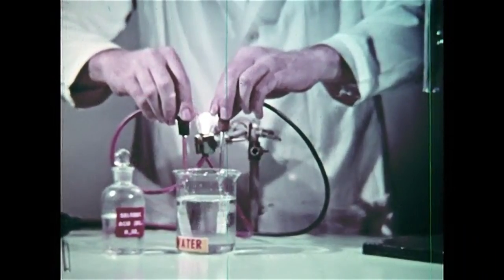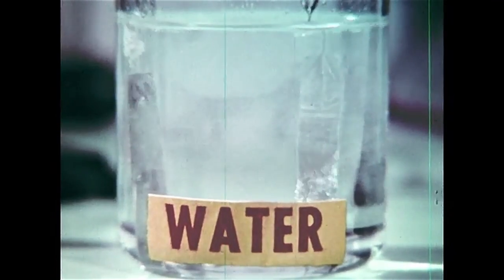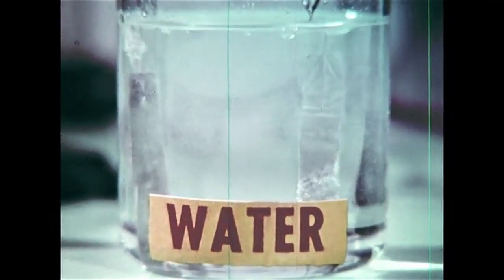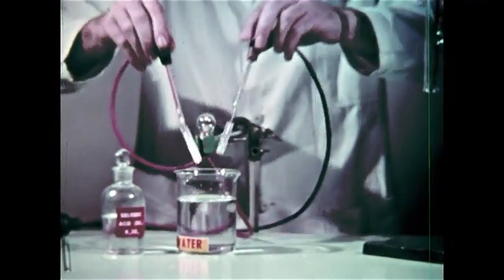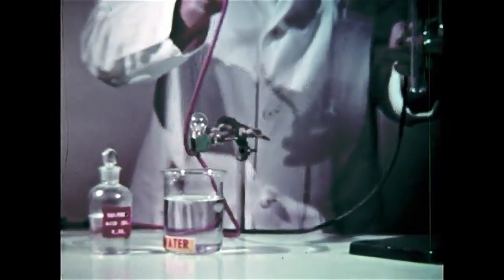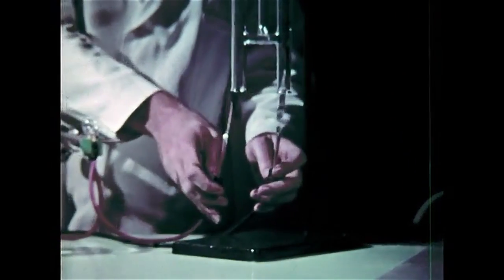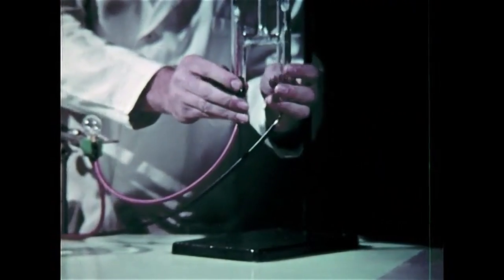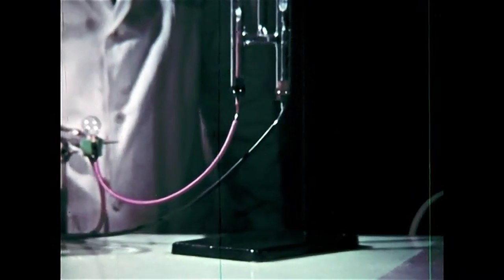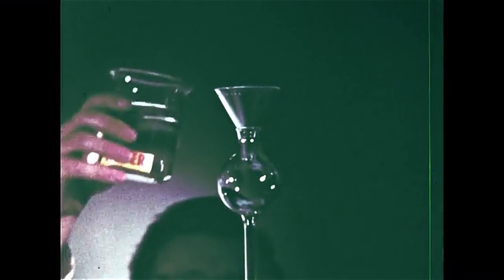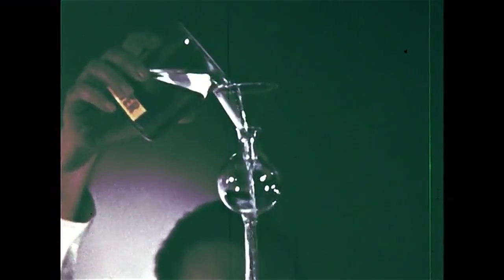The light goes back on, showing that the ions are now being drawn to the poles. So now we'll place the electrodes in this Hoffman tube, an apparatus which makes it easy to separate and collect the gases. Then we add the solution we just tested.